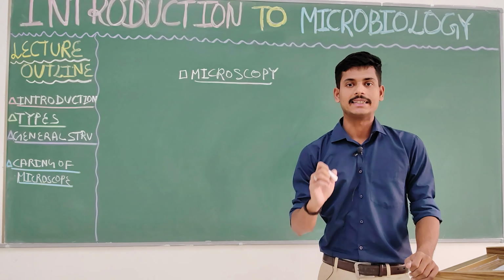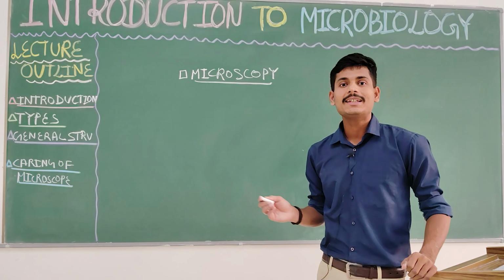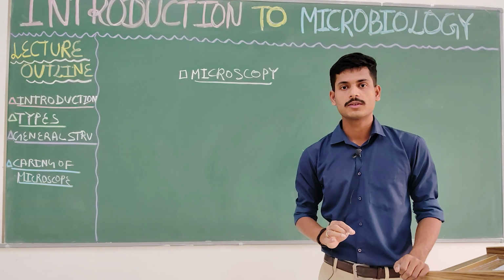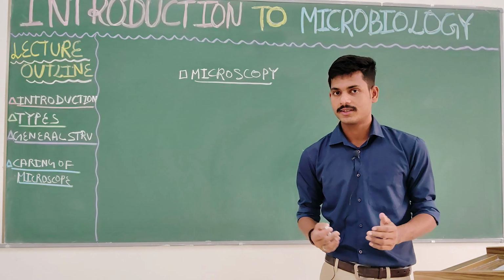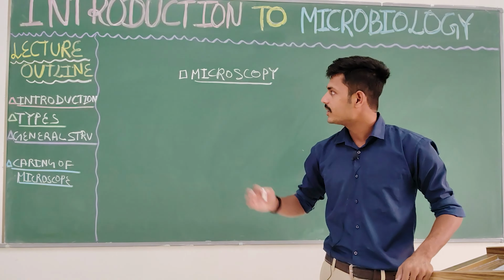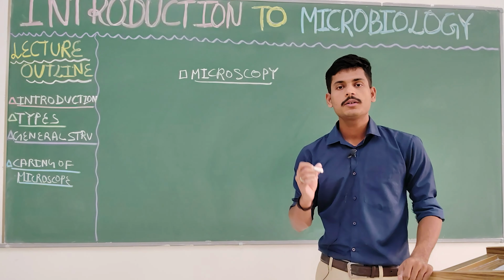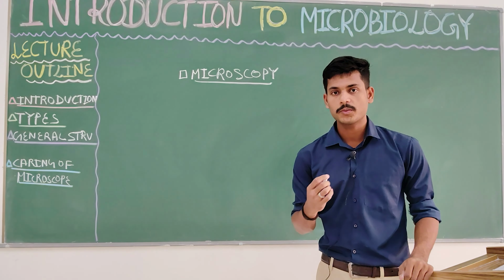the smallest things. It is not limited to seeing only microbes or pathogens; it is also used in different fields and different industries. But for our discussion, we are discussing those microscopes which are involved in microbiology, in understanding the microbe structure.